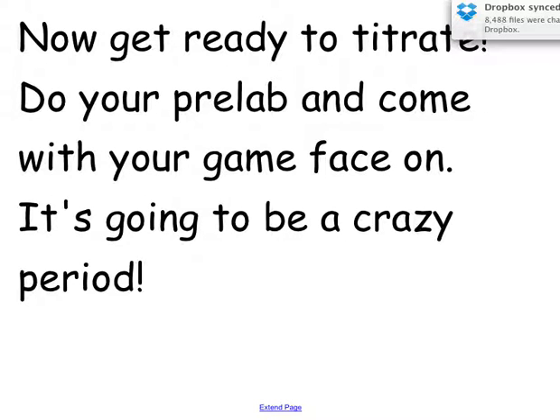And then finally, last little slide. Now get ready to titrate. Do your PreLab and come with your game face on. It will be crazy. Miss Rozier and I are stressed on these days because we know how many points you really need to take. And you got to have a sense of urgency. You've got to do teamwork. When one person's cleaning up, the other person needs to be filling the burette. You got to work together and you got to work hard the whole period.